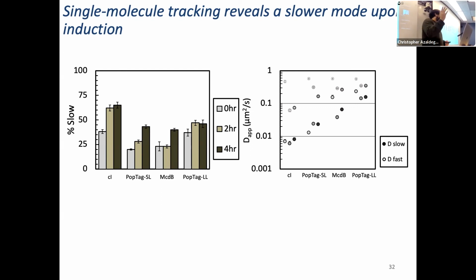I didn't include things in between because these are distributions, and I didn't want overlap between things that might be slowly diffusive but color coded magenta as fast moving molecules. But again, those are arbitrary values that we can change to get a clear understanding of the localization of these different dynamics inside of the cell.